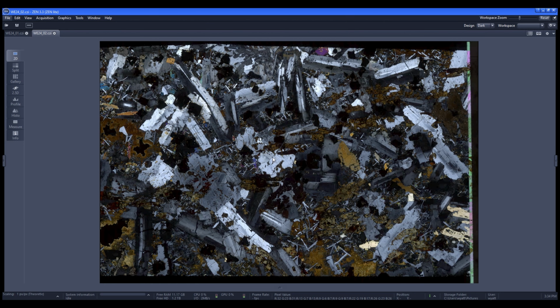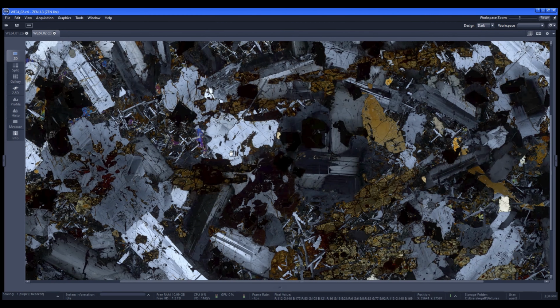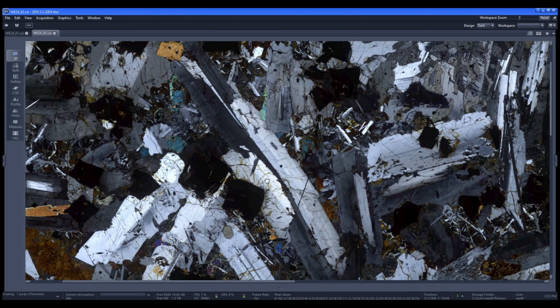Here's the next sample. This is also from Black Butte, the summit area, but you can see it looks completely different. As I said, lavas typically cool quickly, right? But this is a part of the conduit that was likely shielded and insulated, and was probably degassing as well as releasing fluids. This allowed the magma to start evolving compositionally, and also allowed for larger crystal growth. So you can see there are some massive plagioclase crystals here that take up most of the view. So let's zoom in on this thin section here. All these giant white stripy minerals are huge plagioclase crystals.